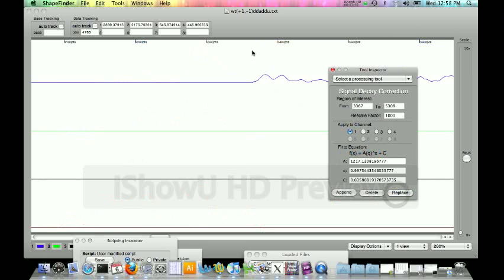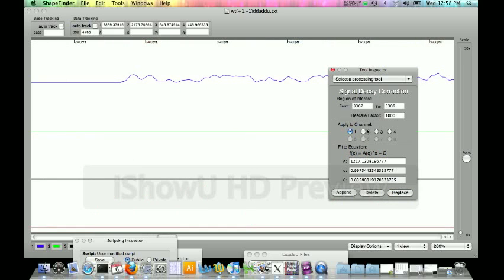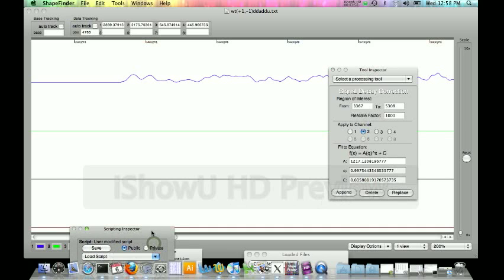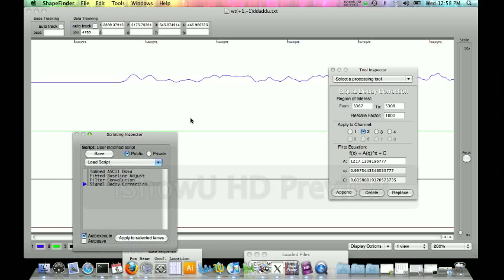You can see our first filter cuts off the RT peak and we have our data right here. We'll apply the second filter but look here the append button has switched places. This is where you really want to pay attention to what exactly you're clicking. So if you click append again we're going to get our second trace, our third trace, and our fourth trace.